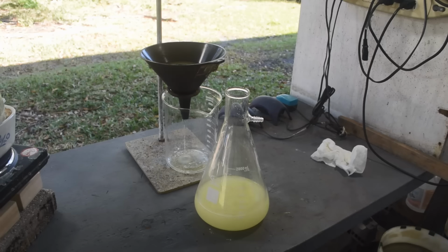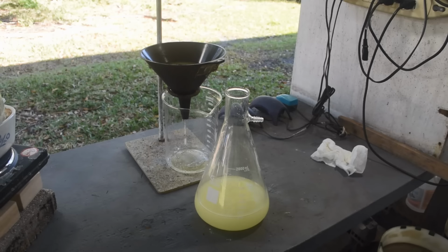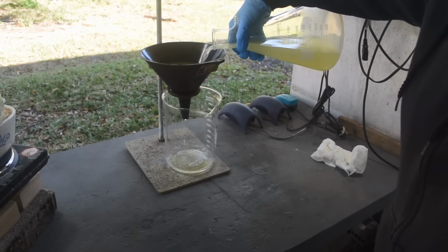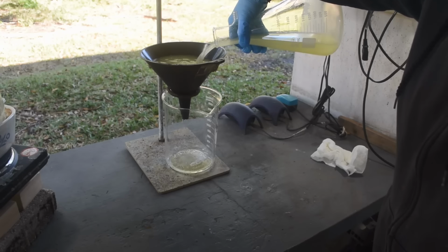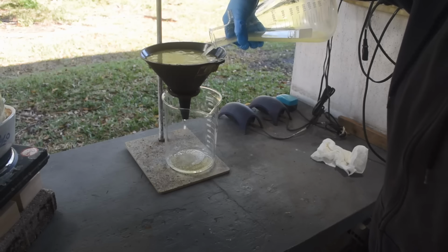Okay, this is going to take a long time to filter because I stuffed cotton tight into the base of this funnel. And hopefully it's going to come through clean and I don't have to funnel it twice. But this is going to take a long time. It's okay, I've got a lot to do today. This can just sit here and filter in the background while I work on my other projects.